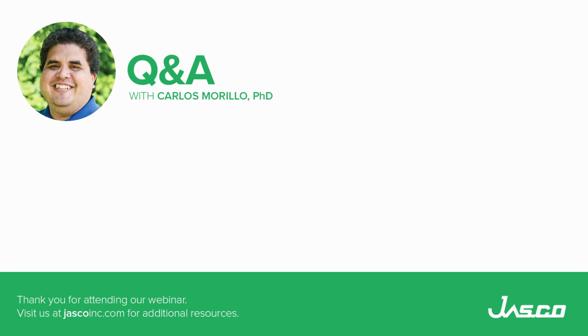We have a question: what is the bottom line of the QRI mapping? How important is a stage in the QRI? How much time does it take to map a 100,000 point area? So the bottom line of doing the QRI is to create an image, especially for a wide area like the tablet that I show.